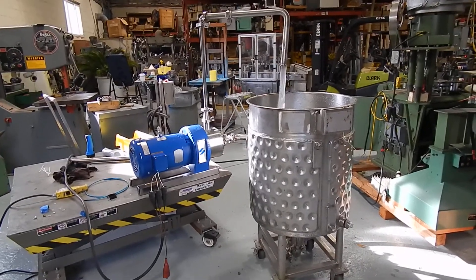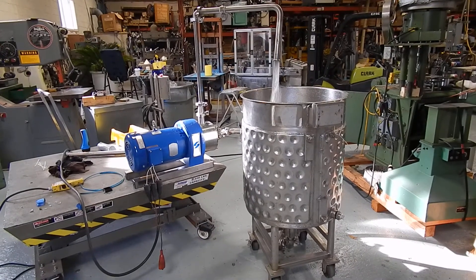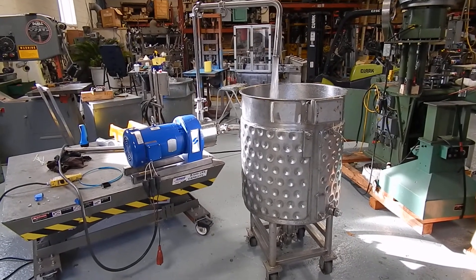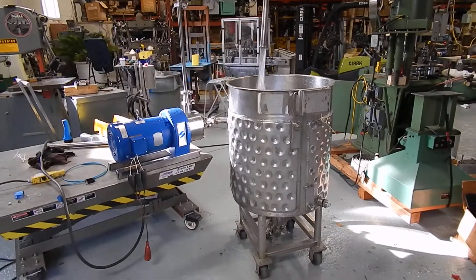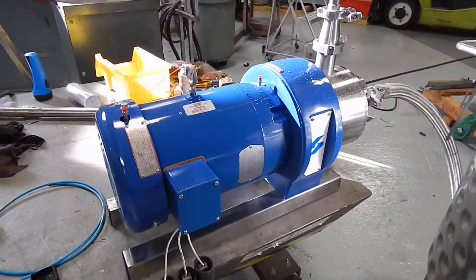Hi, Dave Matthews from Champion Trading. What we're demonstrating today is the final testing on a Silverson 450 LS inline homogenizer emixer. We've hooked it up to water and we're test running on 440 volts right now.